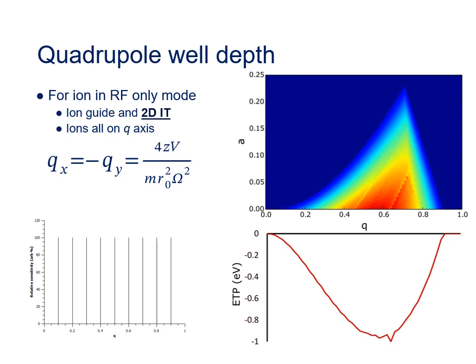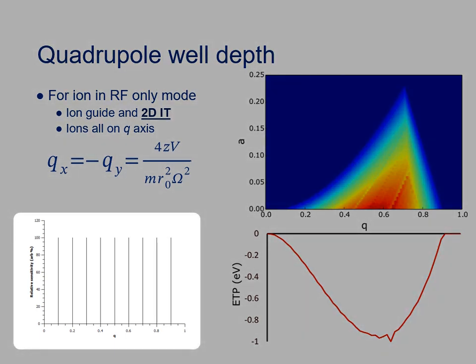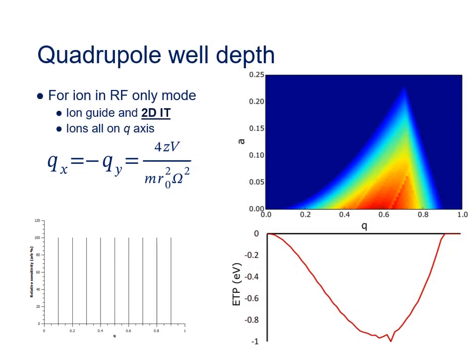So imagine we have coming from our ion source an ion beam containing the signals of 9 different ions, all with identical intensities, and all which happen to be equally spaced in the Q dimension. Now remember that the sensitivity of the quadrupole will vary as a function of its trapping well depth. So that means that after the quadrupole component, the intensities of the ions may not be the same anymore. They may have been restricted by the sensitivity of the quadrupole they passed through.